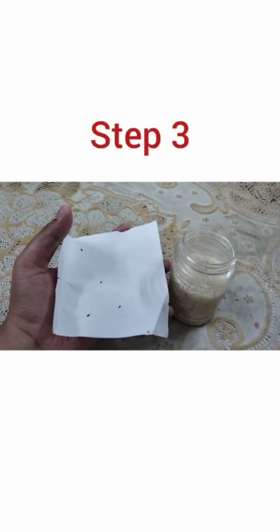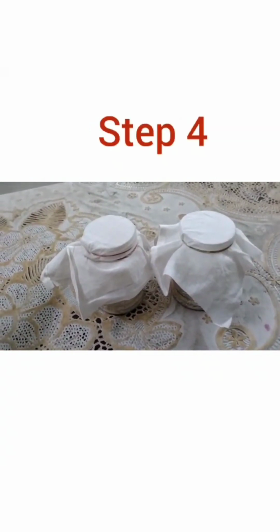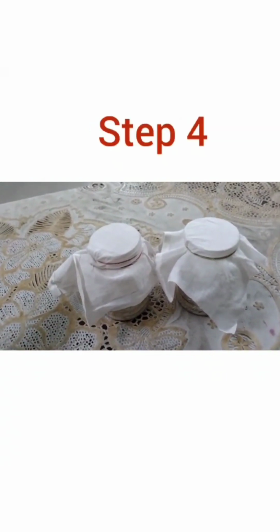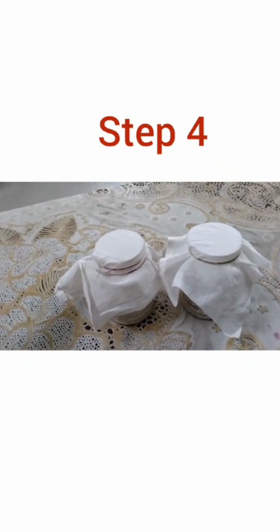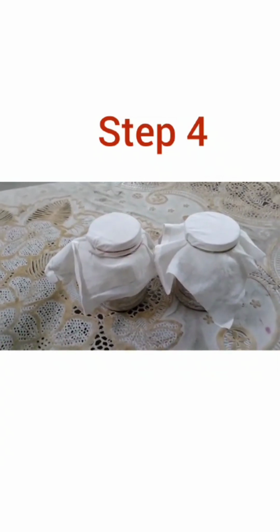I am going to add these rice weevils to these containers. After the addition of the rice weevils, I have covered the containers with 2 pieces of cotton cloth so that the rice weevils can respire easily.